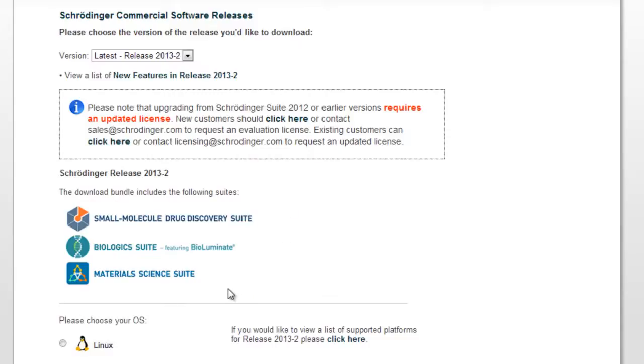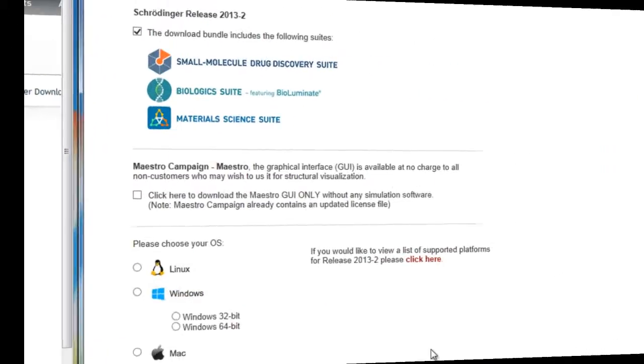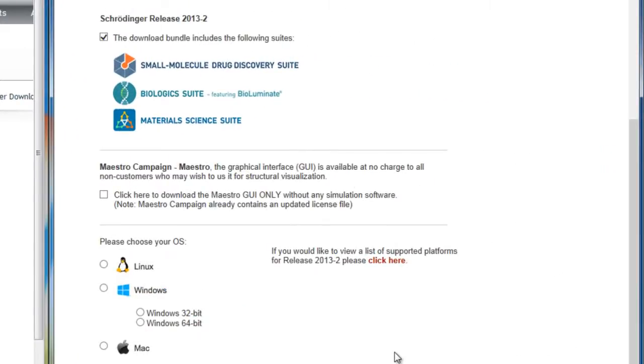Biologics and materials science suites are all included in the download bundle. However, for non-commercial or academic accounts, there is a second option to download only Maestro for visualizing structures.